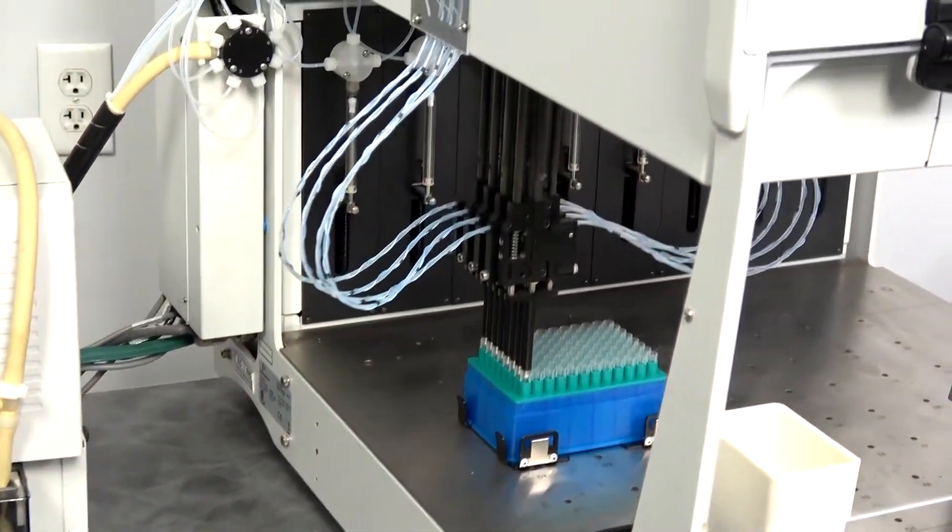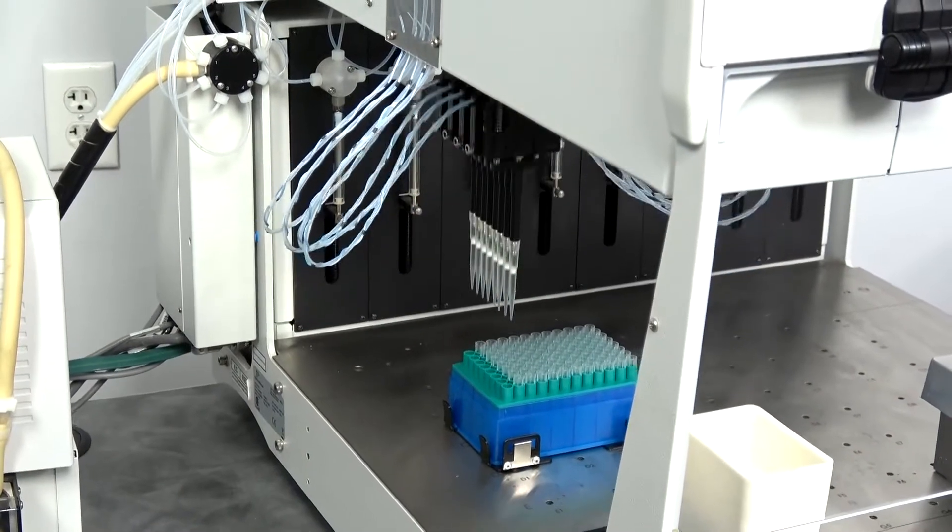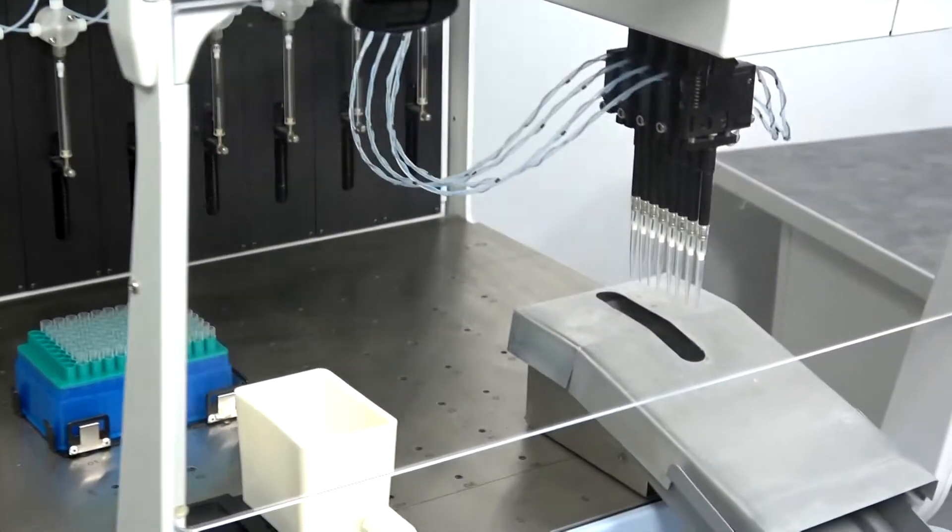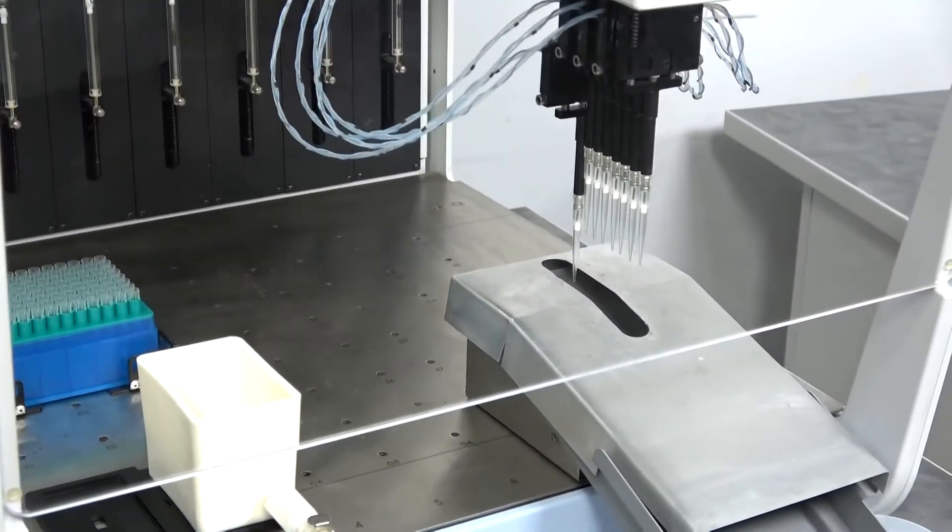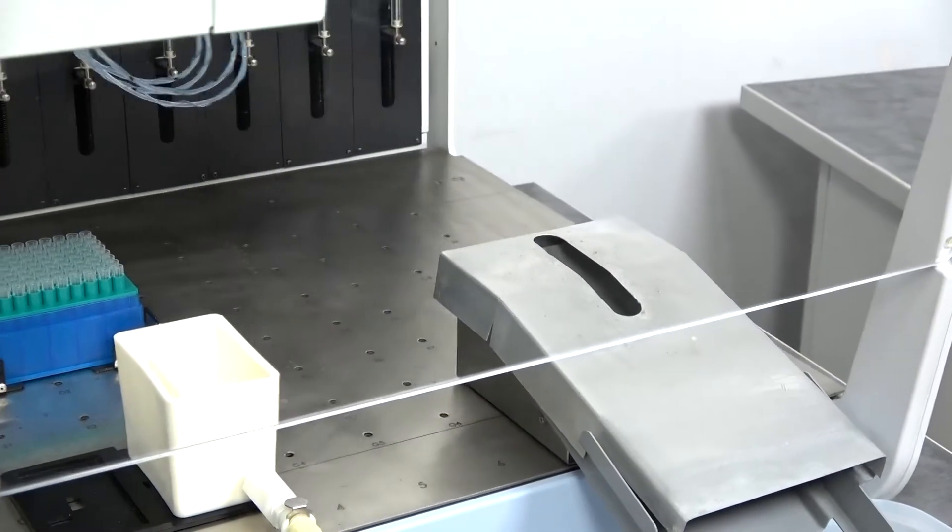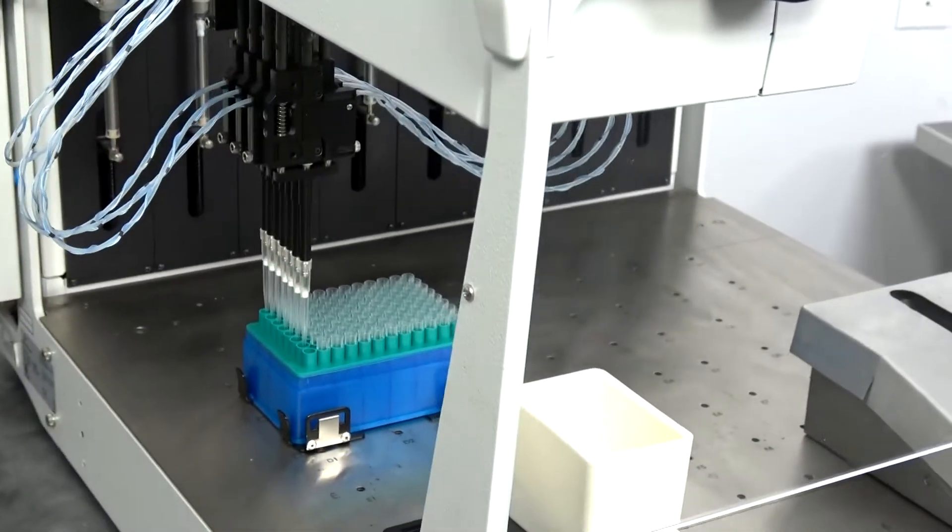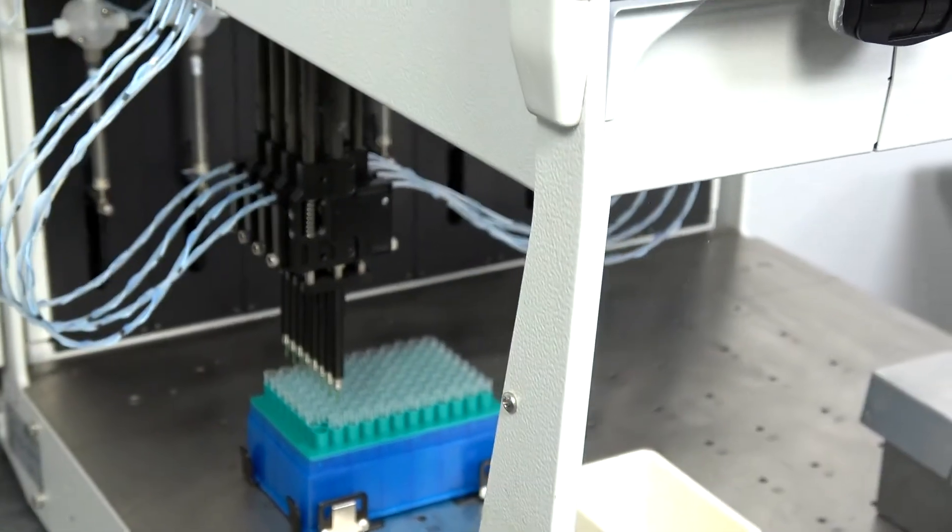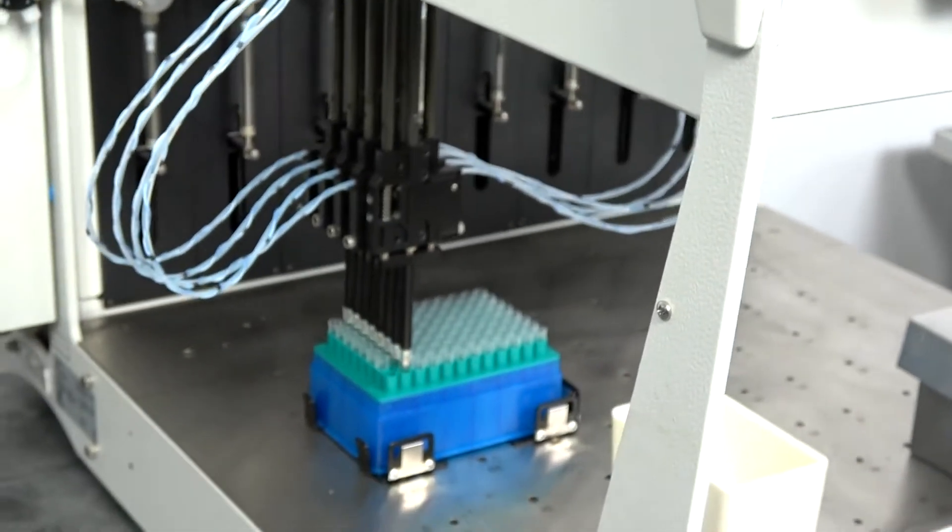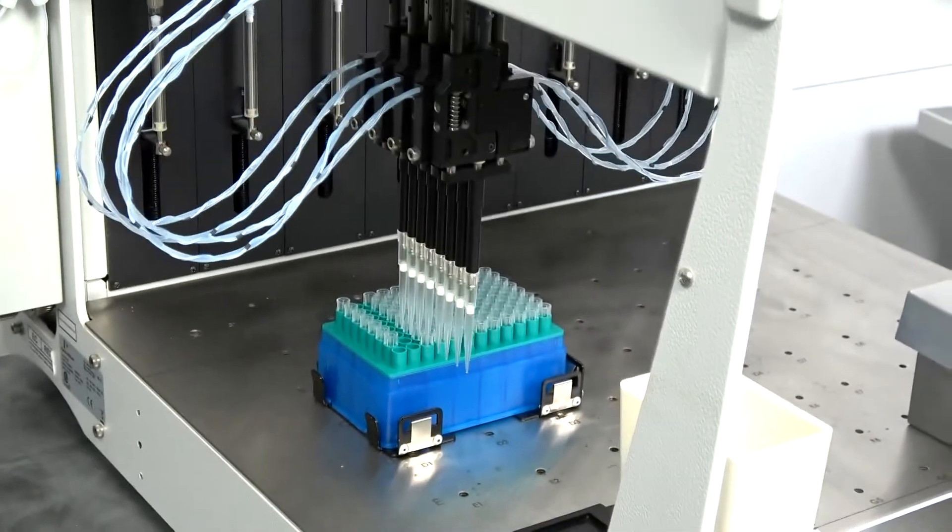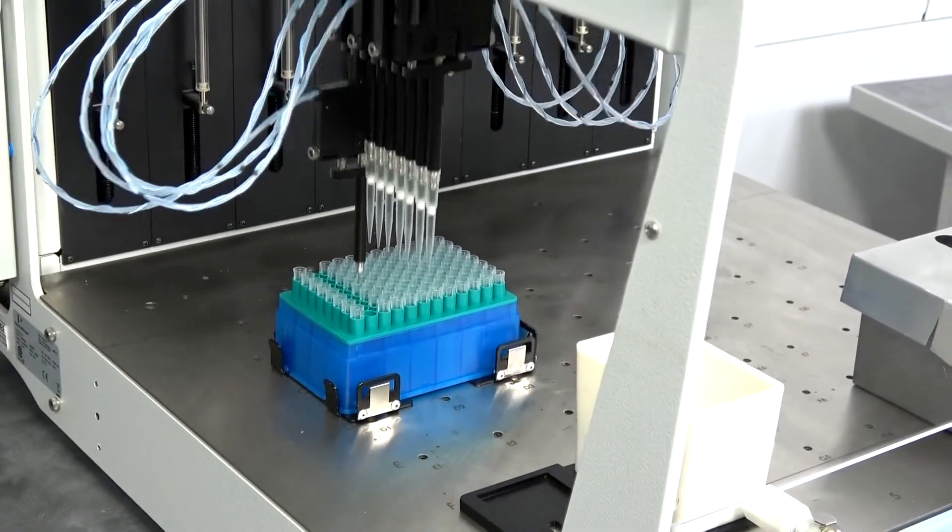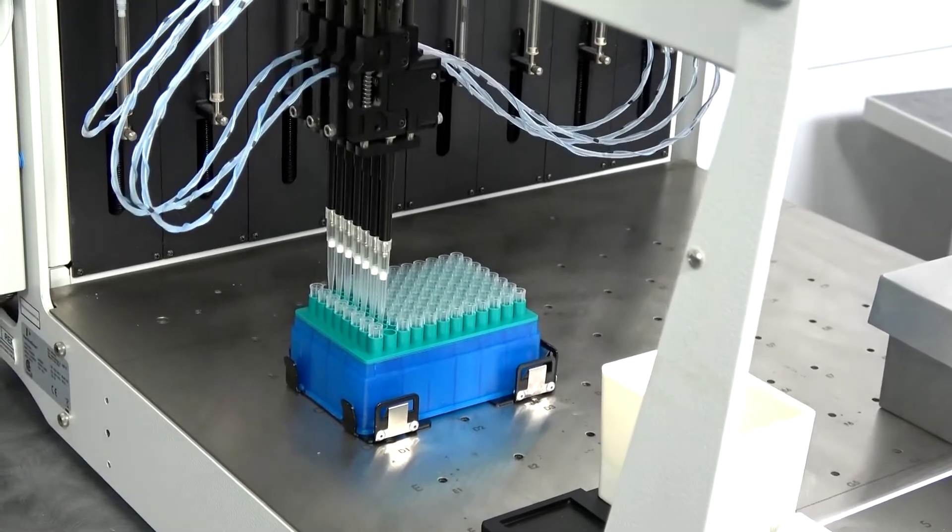Here we're showing off the VariaSpan 8, although this particular protocol doesn't show the separation. But the VariaSpan moves each tip independently, both in width, height, and how much it's going to dispense.